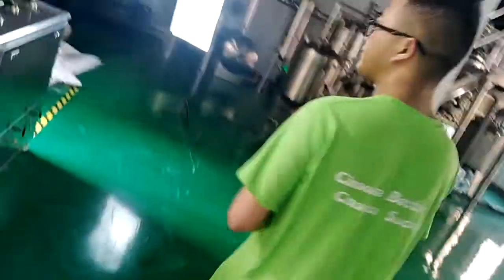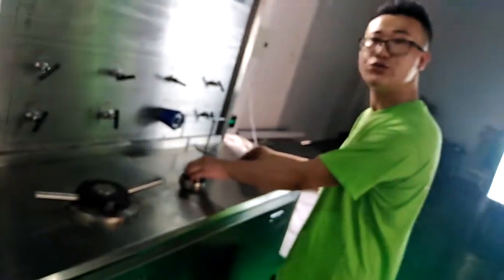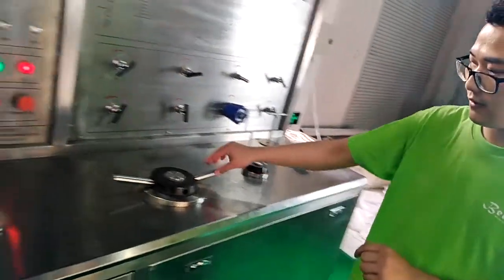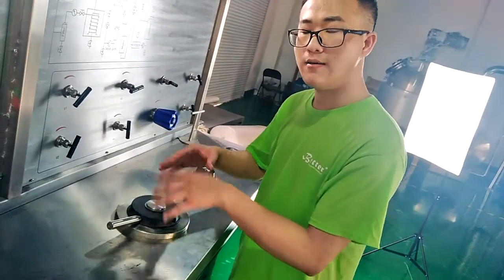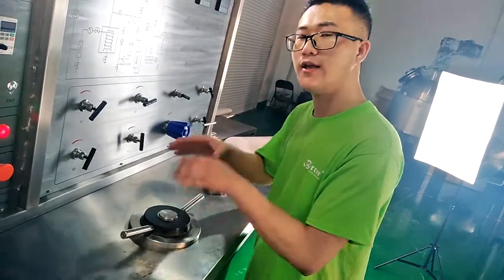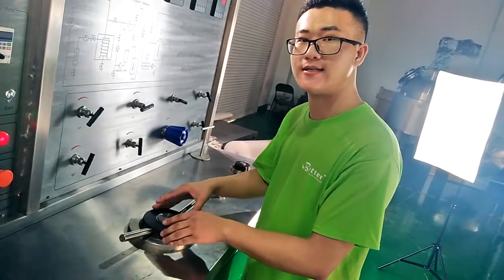Now let's go to the front of the machine. You can see the swing vessels here. This is the extraction vessel — it's 5 liters. And these two separation vessels are both 3 liters capacity. For the extraction vessel, there is a biomass canister inside. When we put the biomass into the canister, then put the canister into the extraction vessel, we can do the extraction. When the extraction finishes, we get the canister out to discharge the spent biomass.